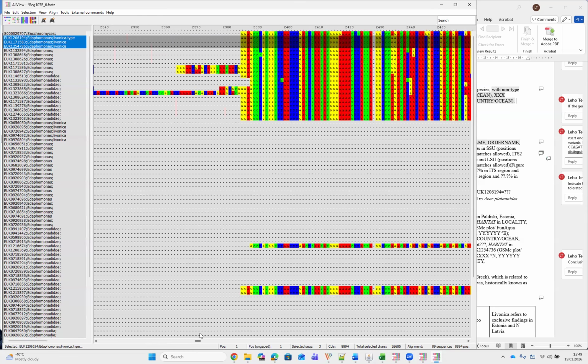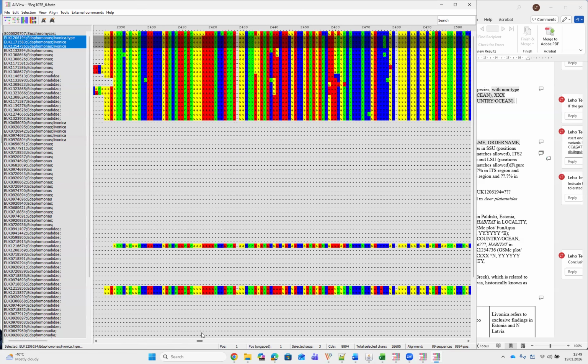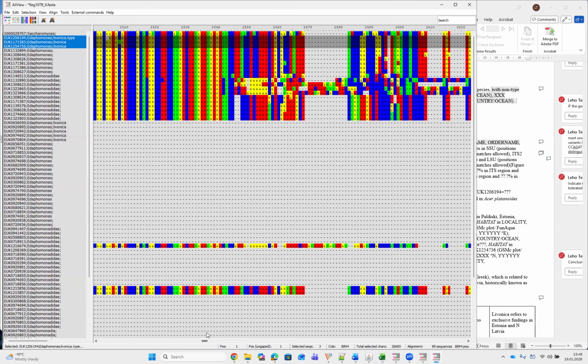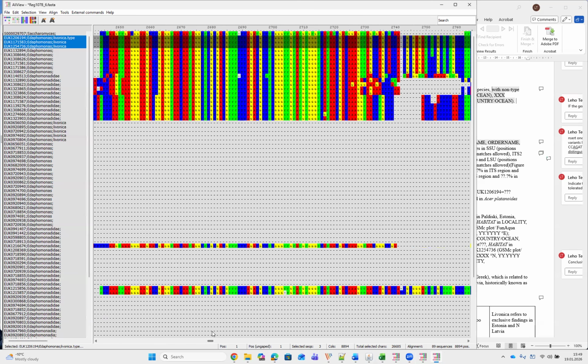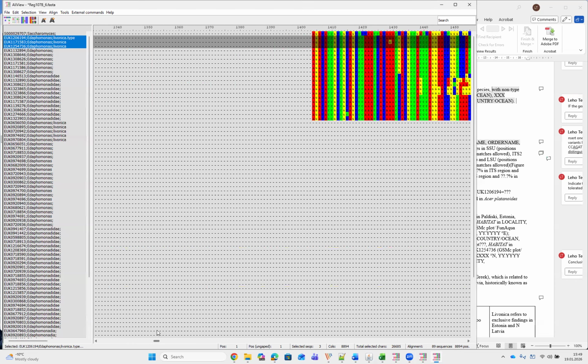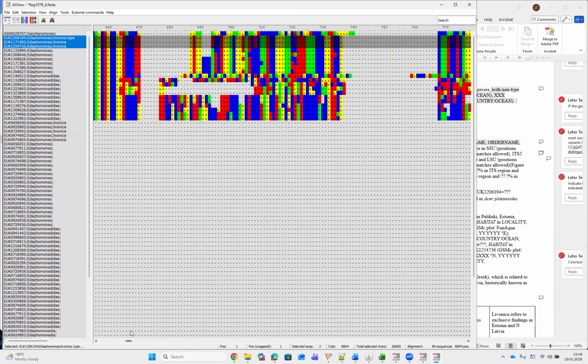That's indeed really long compared to regular introns. Again, we don't see anything unique, and we are getting quite far to the right as well. So since the first one looks fine, we can use this one. So let's double check.